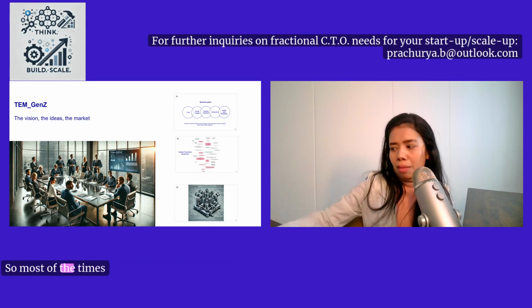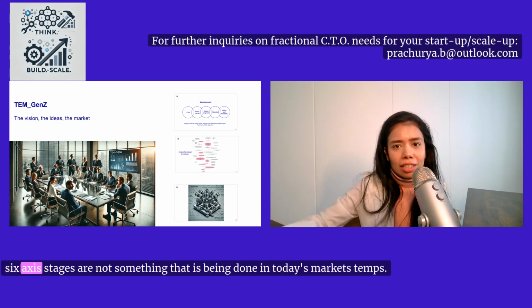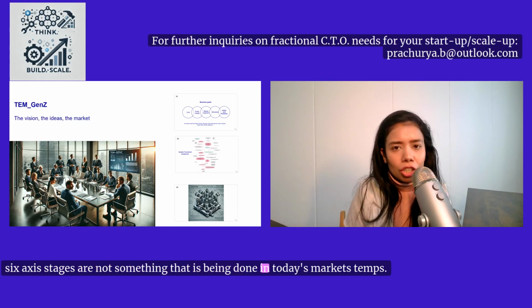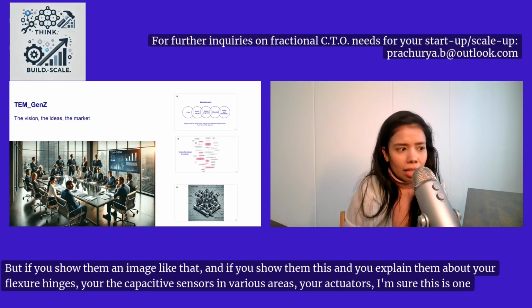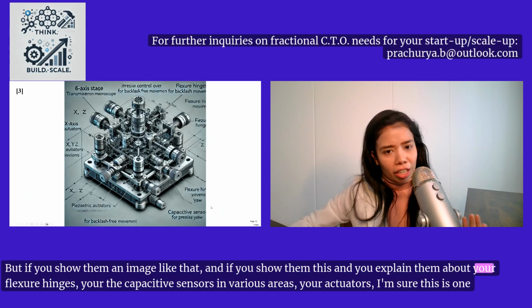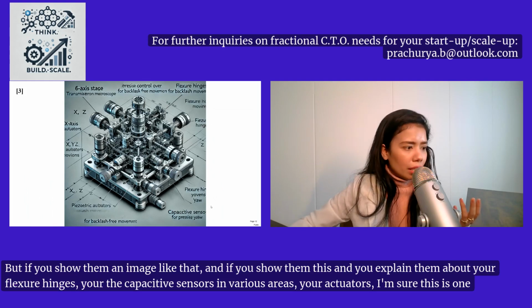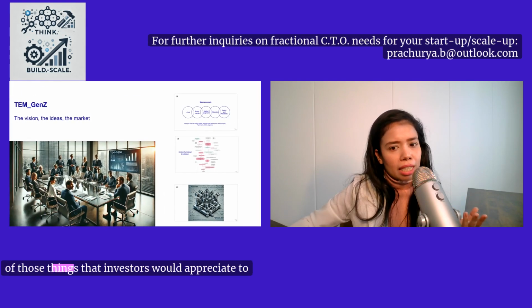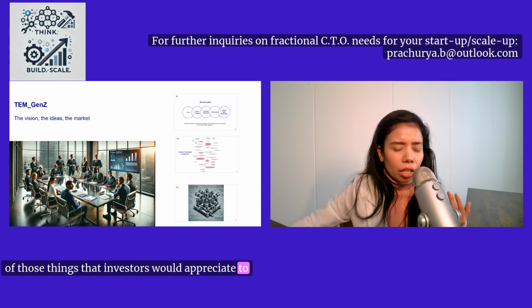Most of the time, 6-axis stages are not something that is being done in today's market TEMs. But if you show them an image like that and explain your flexure hinges, the capacitive sensors in various areas, your actuators, I'm sure this is one of those things that investors would appreciate to a good extent.